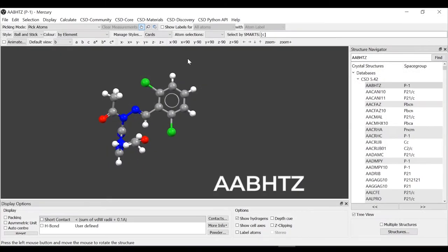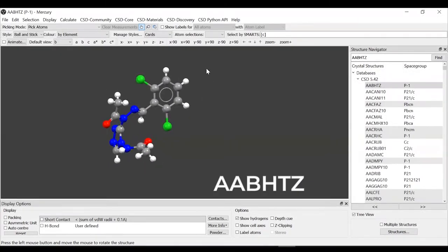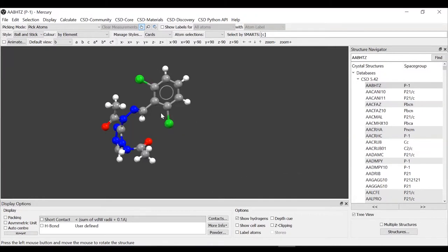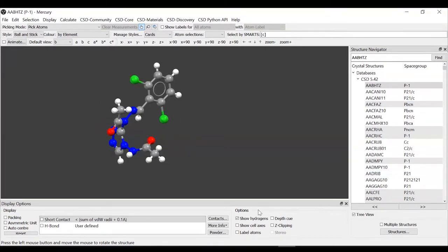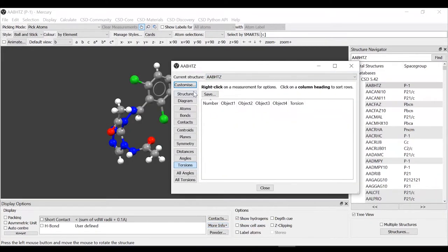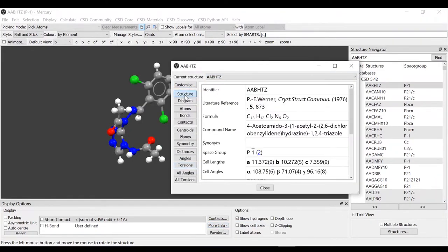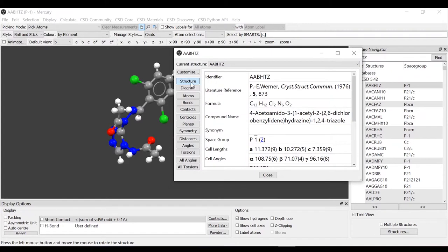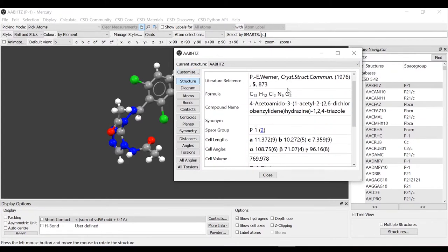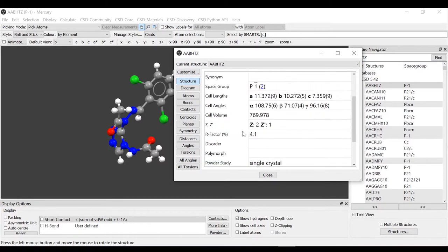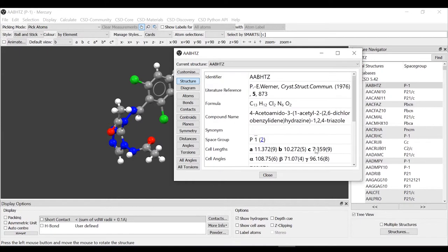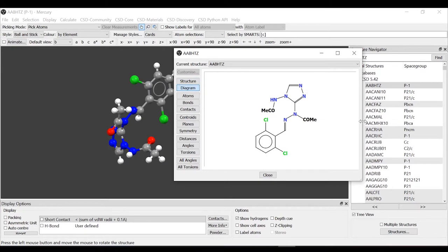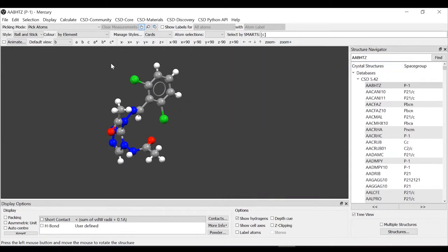We're going to use this structure for the first part of this demo. If we want to learn more about it, we can just go to display option, more info. We can see all the information about the identifier, literature, the information about the unit cell and the crystal cell. We have the compound name and if available also synonyms. We can see the 2D diagram here as well.